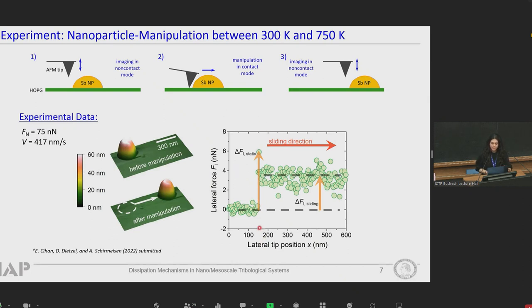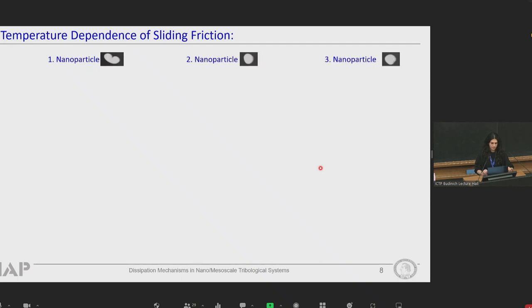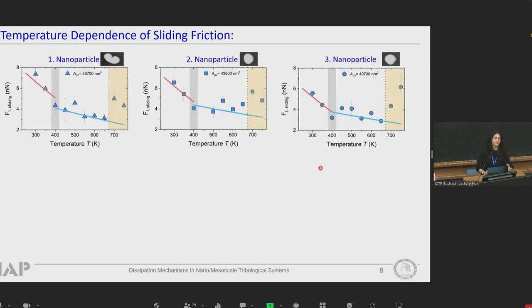Here is real experimental data. The AFM tip gets in contact with the particle at about 150 nanometers, resulting in an increase in lateral force signal, and immediately after that the particle began to slide. The first set of manipulation experiments were performed for a group of three nanoparticles at different temperatures between 300 Kelvin and 750 Kelvin. Temperature was progressively increased in 50 Kelvin steps resulting in friction forces for 10 different temperatures. The very first result we can see is that very similar temperature-dependent behavior was observed for all three nanoparticles.